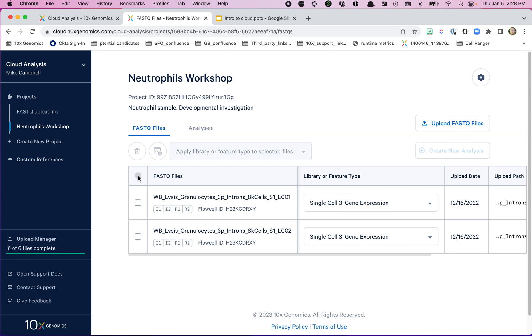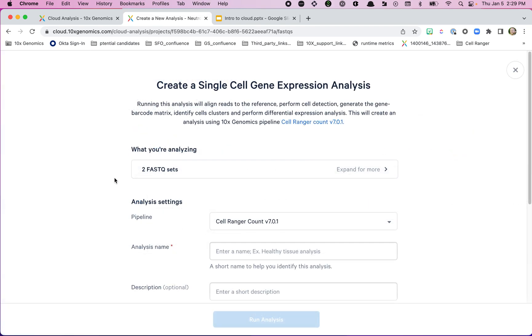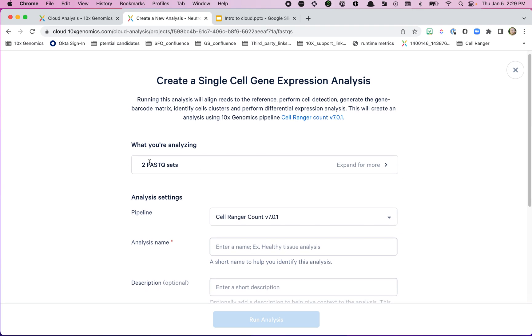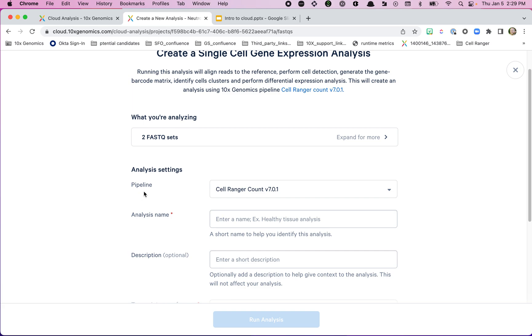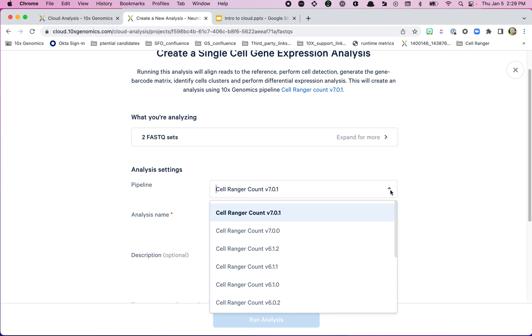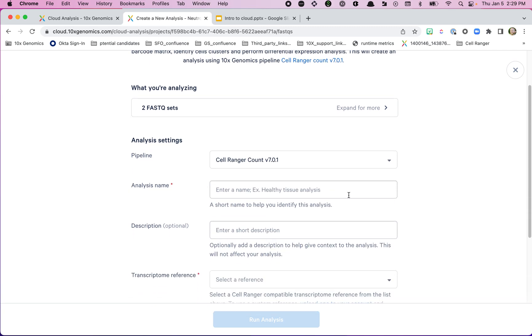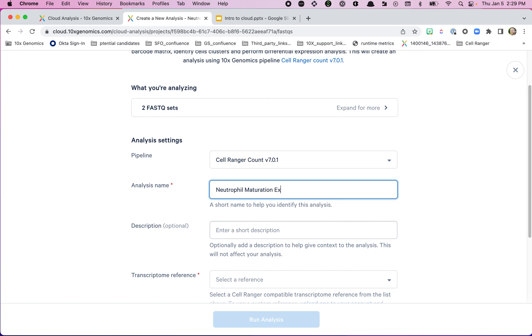I've already marked these as three prime gene expression libraries. To create an analysis, I'll select both sets of FASTQs using the select-all checkbox — I want both since they came from the same library and are required to reach the sequencing depth we wanted. Now the 'Create New Analysis' button becomes active. I click on it, and it lets me know we've got a couple FASTQ sets. I'm going to choose the Cell Ranger 7.0.1 pipeline — the most recent available at the time of recording. I'll name this analysis 'Neutrophil Maturation Exploration.'